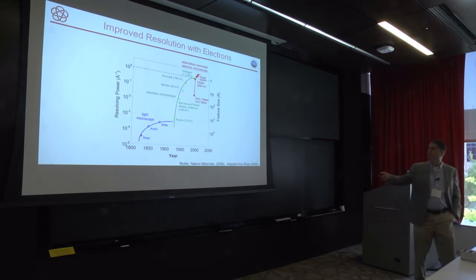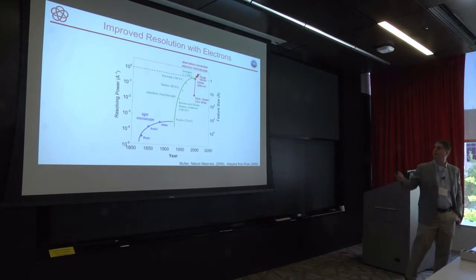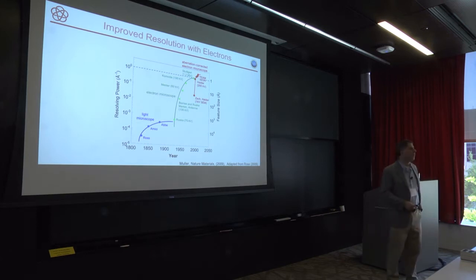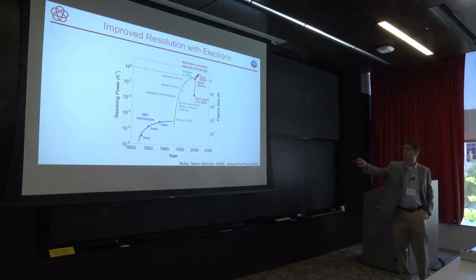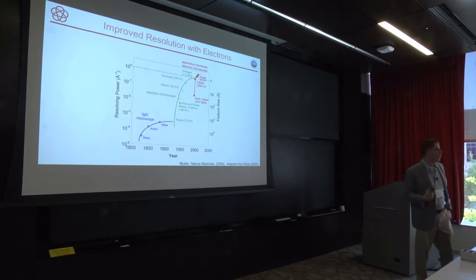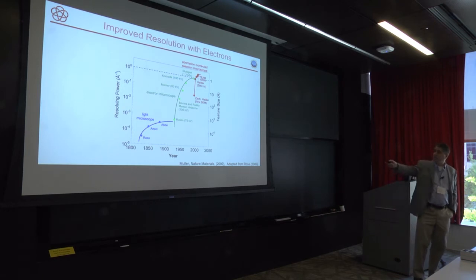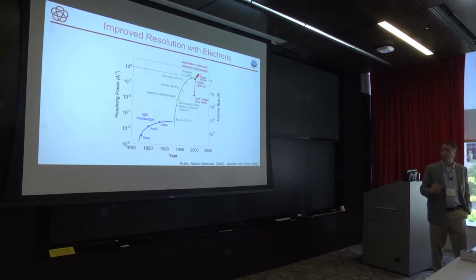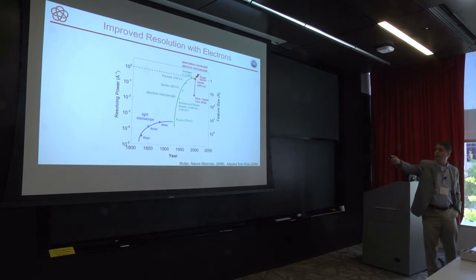And for about 50 years, the way electron microscopes got better was that you just kept pushing up the beam voltage of these instruments, because that made the wavelength shorter and shorter and shorter, until you get to a point over here where the energies of the microscopes are so big that all your papers start with the words "irradiation damage study of." So that is sort of a dead end, and there are maybe only 1 or 2 microscopes at that voltage that are still operating today. Most of them have been decommissioned and replaced by machines with aberration correctors.